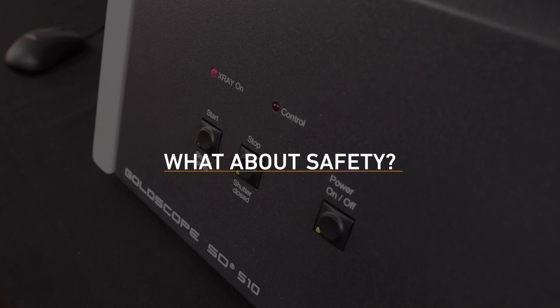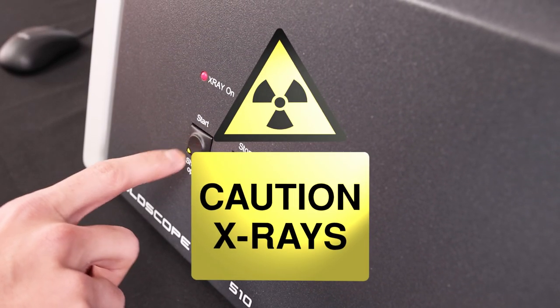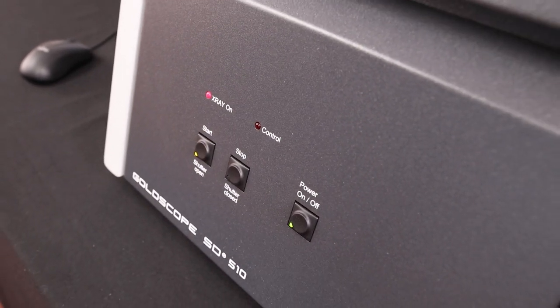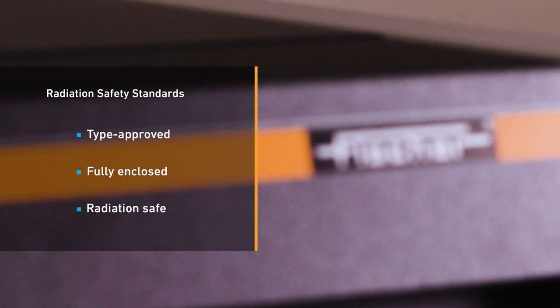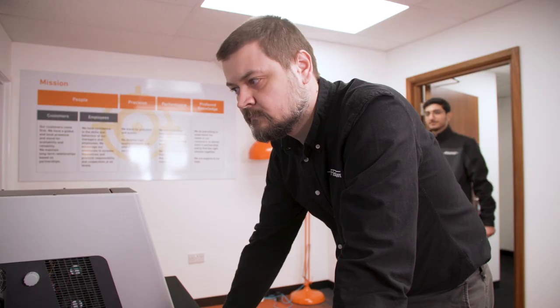Safety is of the utmost importance to us and our customers. All Fischer GoldScopes are fully protected instruments with type approval according to current radiation protection legislation. As a fully enclosed instrument, it provides paramount safety for all operators, ensuring no risk of radiation.